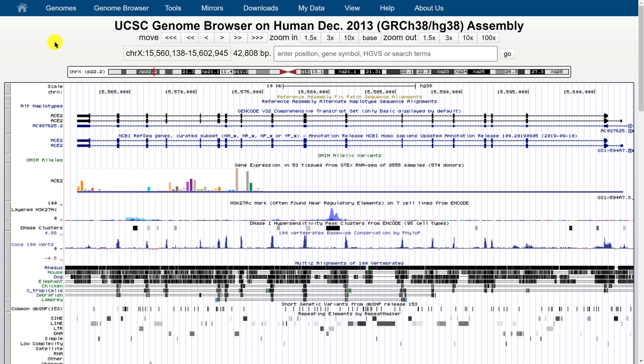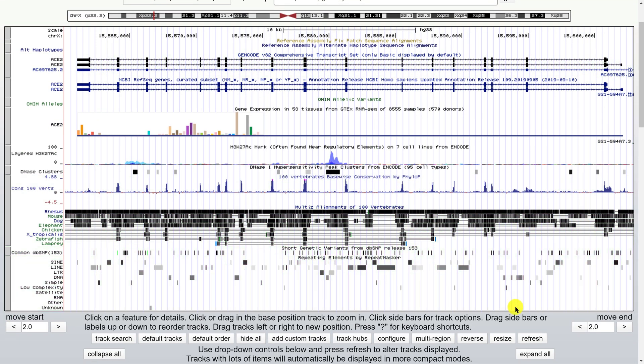Once you've got that, you might notice the white box that I'm moving my cursor around in — that is the genome browser, that is the output it's showing you, and that's the content that will change as you play with the browser and upload more data. This browser window may not be filling your screen, or even worse it might be spilling off the screen and you may need to scroll left and right to see it all.